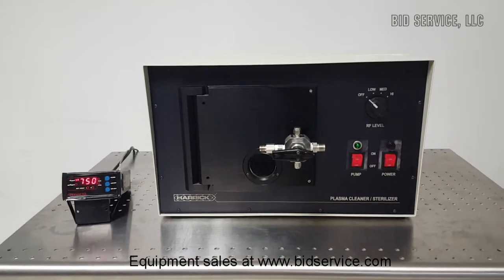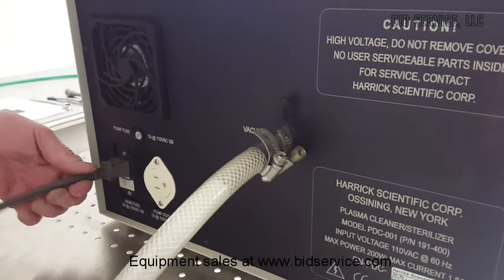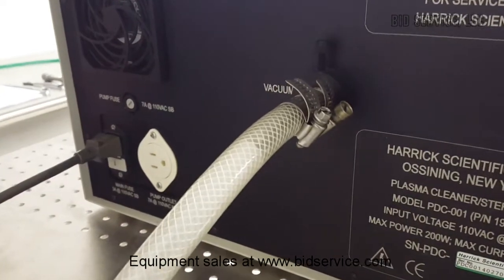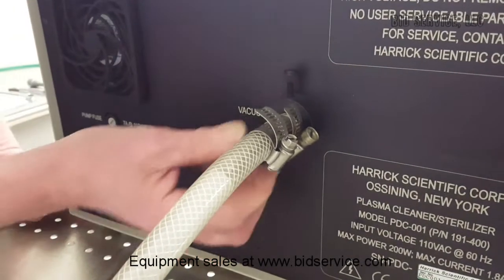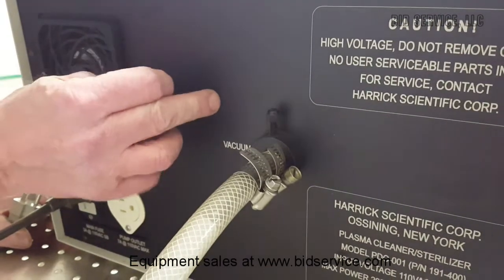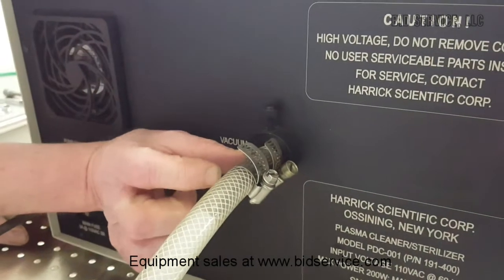Let's take a look at the connections in the back. This is our input power — 110 volts AC. This is where you would connect your vacuum pump. Take care because this is actually the neck of the Pyrex bell inside the chamber. It is glass — very sturdy — but just remember there is always a piece of glass sticking out about two inches.